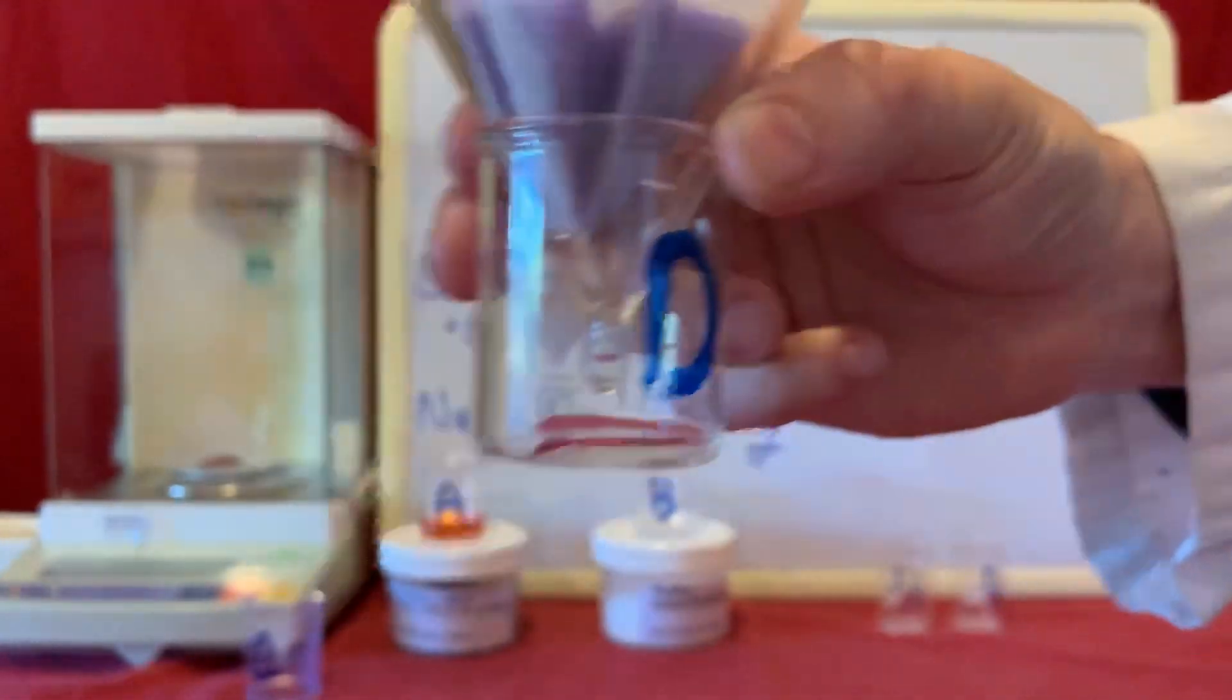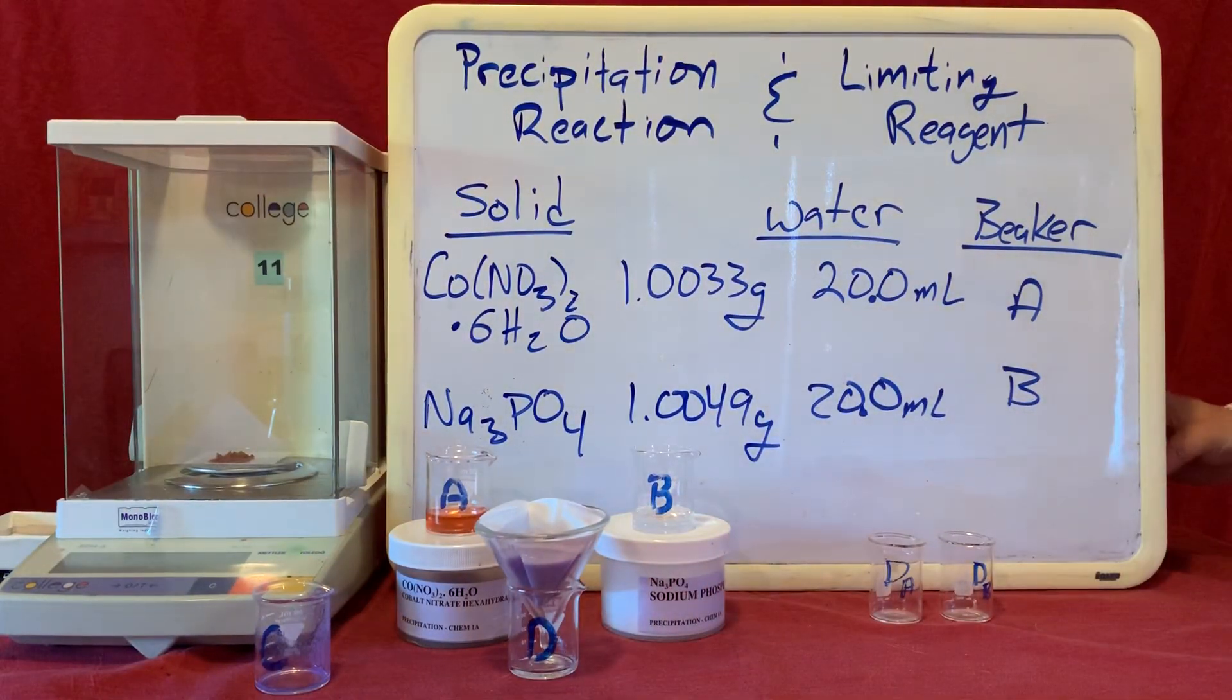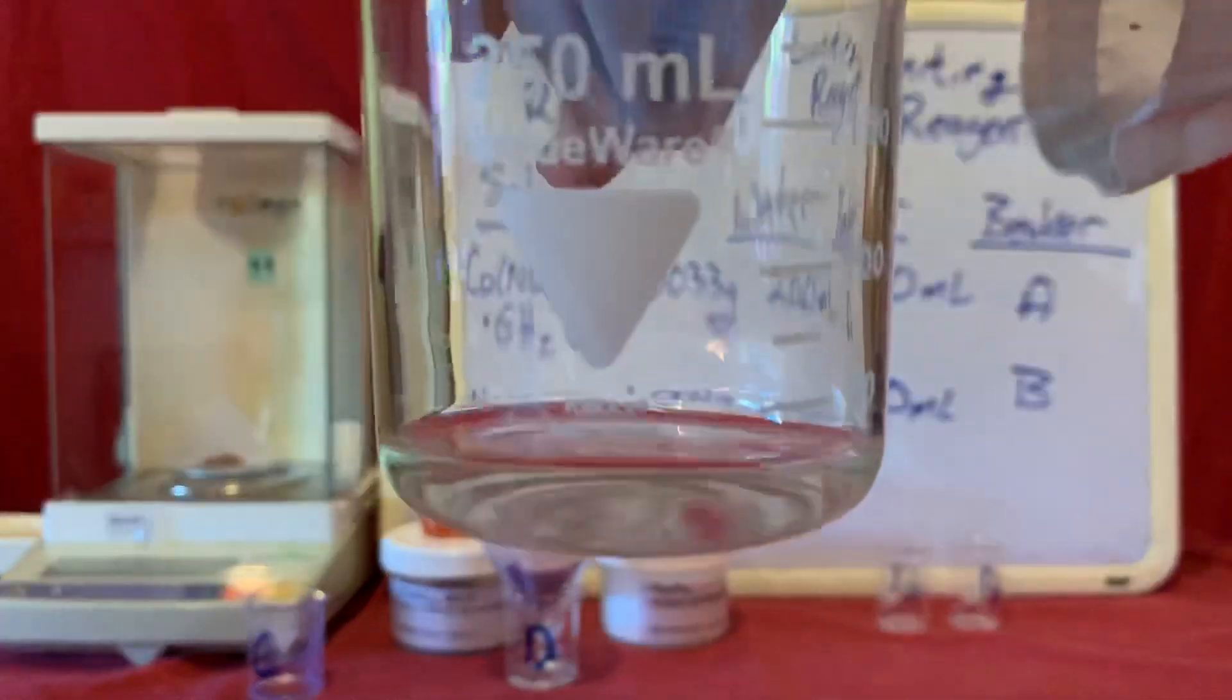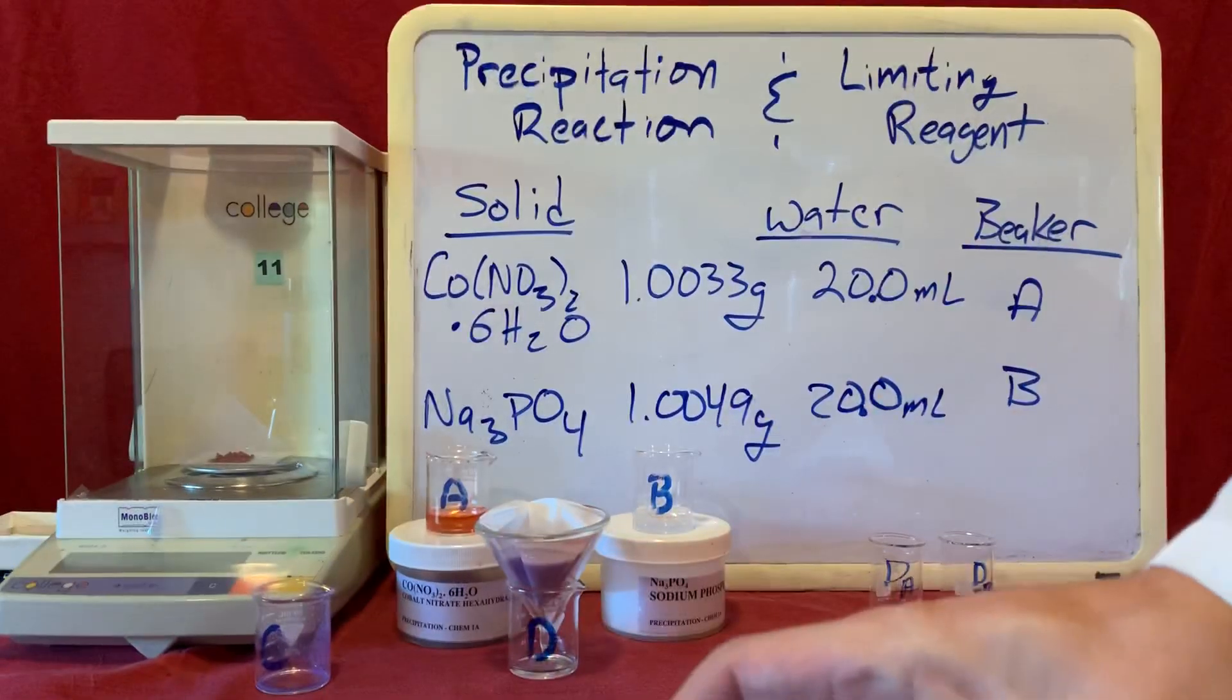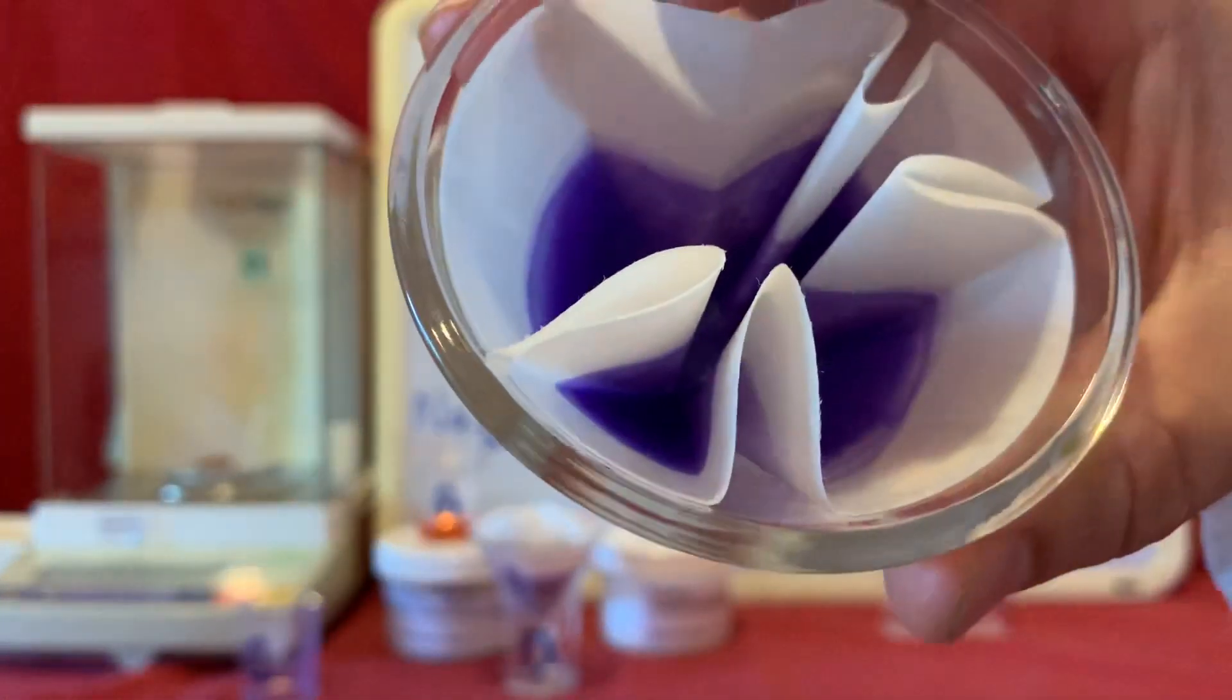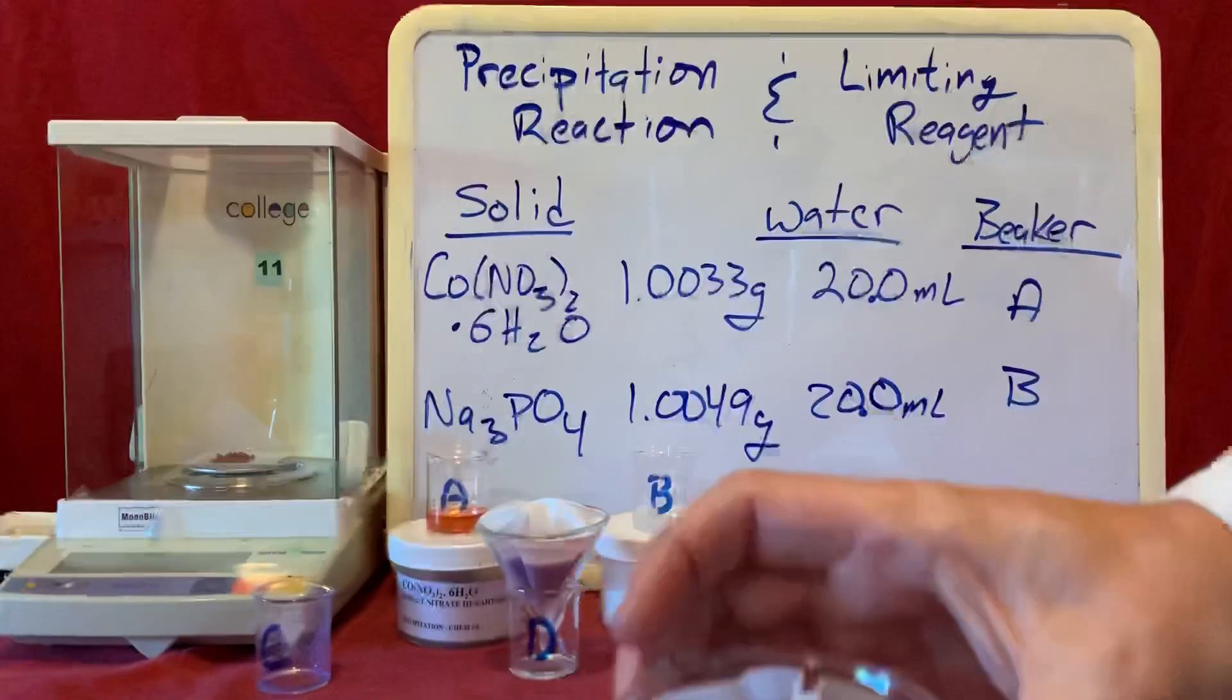Now to speed this process up for the purposes of our video, I've preset a solution where I've already let this all filter out. So you can see here I've got my filter paper now with no liquid left in it, just a bunch of solid coating the bottom of my filter paper.